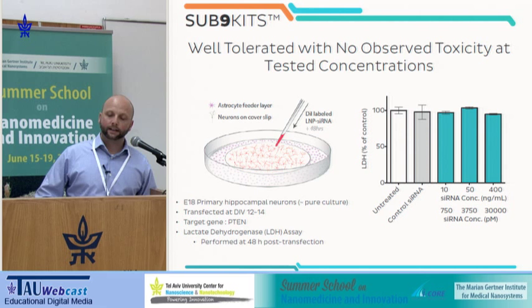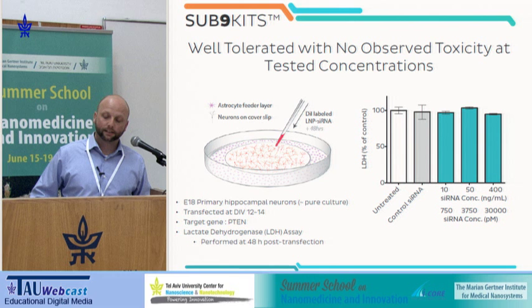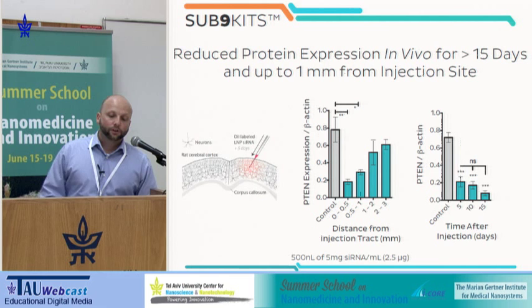Also, just very quickly, I'll go through this data. These particles, because they are really these clinical-based technologies, have very low toxicity. Again, this is E18 primary hippocampal neurons, pure culture. Toxicity was measured with an LDH assay. And we see that at over 40 times dosage, we see essentially no toxicity compared to the delivered nanoparticles in the previous slide shown here.